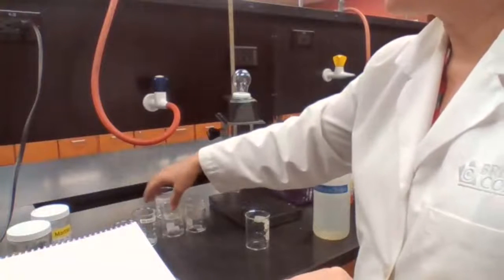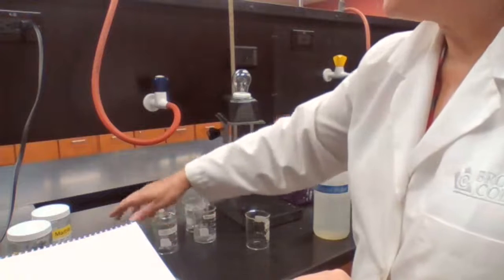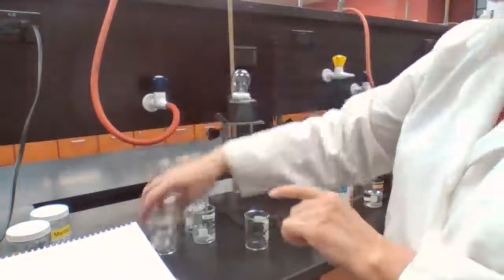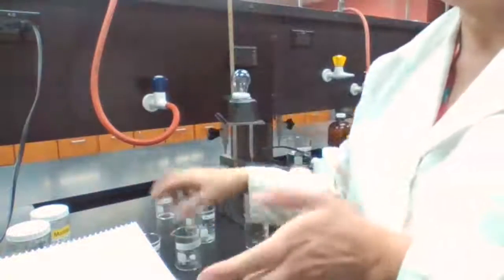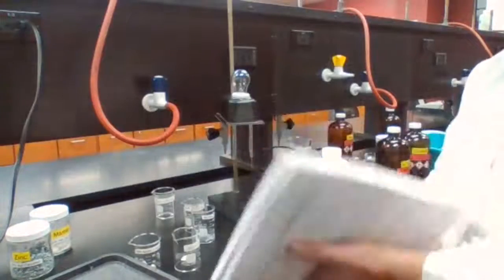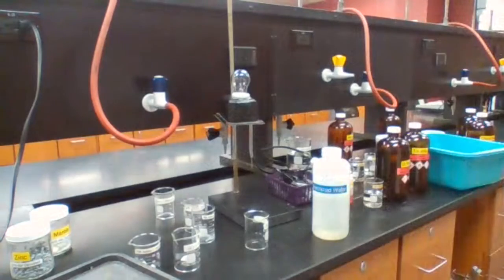We are going to take a piece of marble and add acetic acid, and take a piece of marble and add HCl, to compare which one is stronger. The acids we are going to use are 6 molar acetic acid and 6 molar hydrochloric acid.